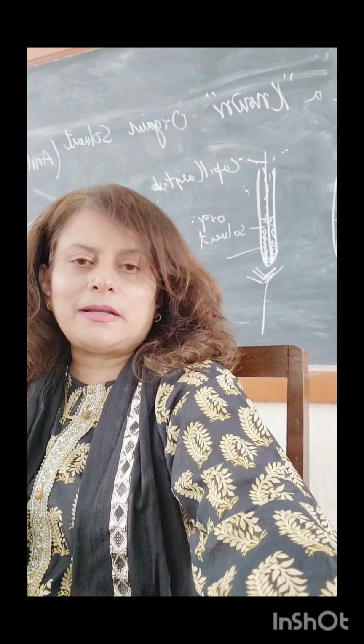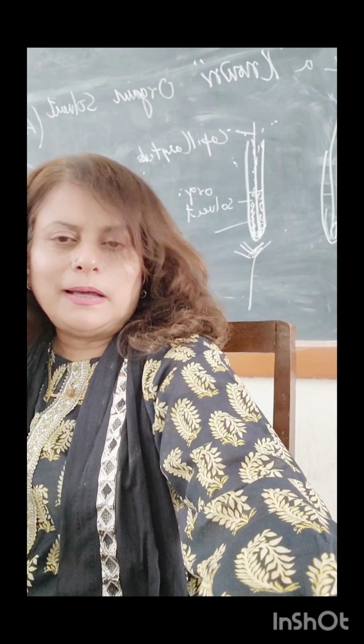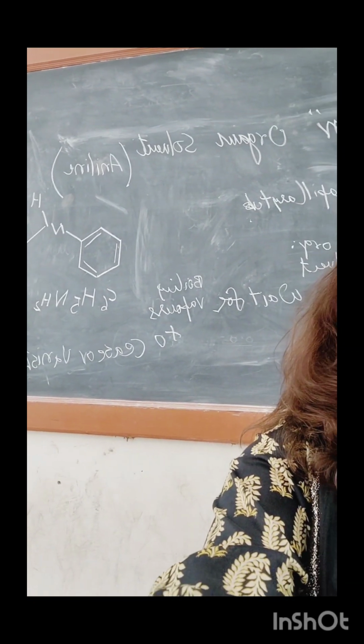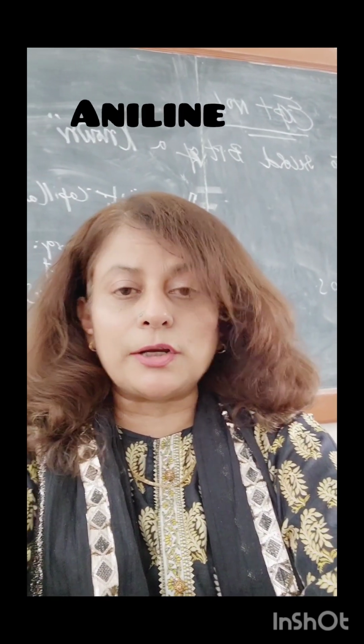When the bubbles emerge, and when they cease, the solvent that they are analyzing will start rising inside the capillary tube, and they will record the boiling point at that moment. So I explained everything. It's a known organic compound. Today I gave them aniline. It is also called phenylamine, and the phenyl group is attached directly to the amino group.